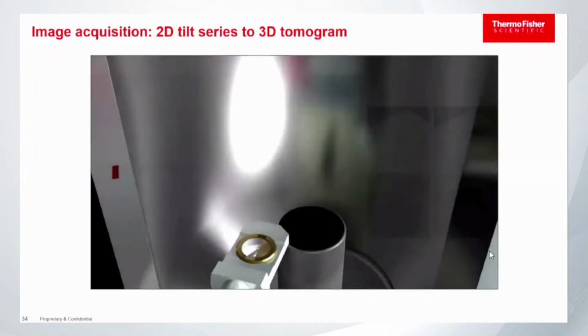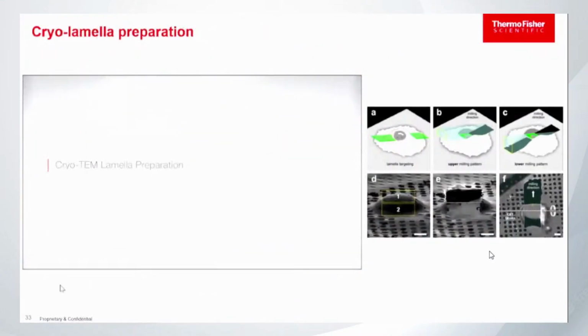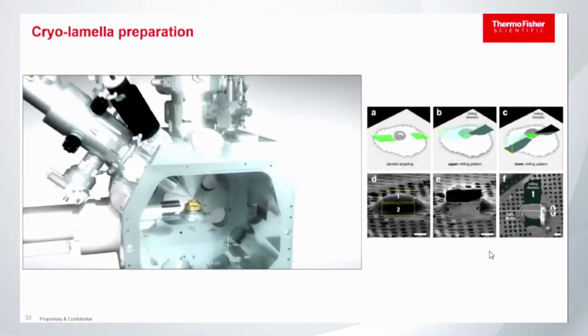Oh, I went too fast. Let me play this video here because this is very cool. This is the internal anatomy of the cryo-FIB-SEM instrument.